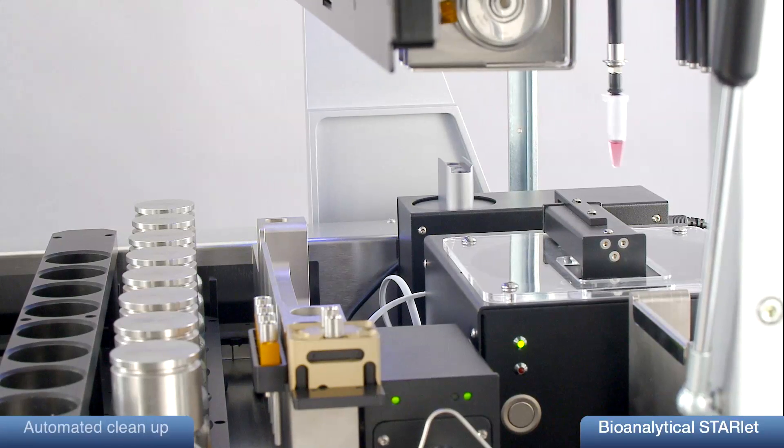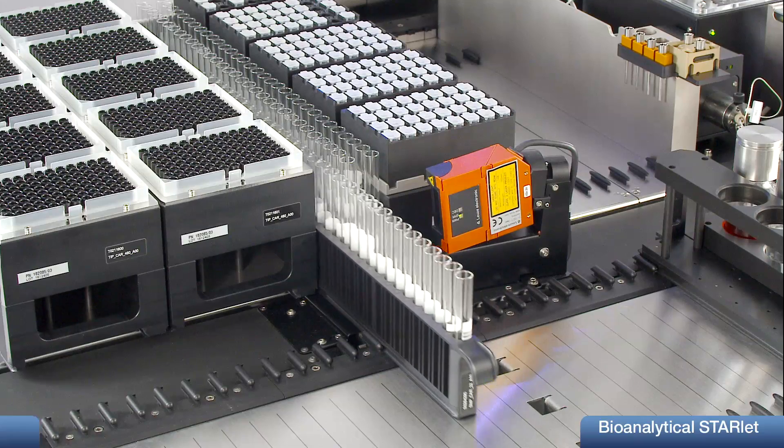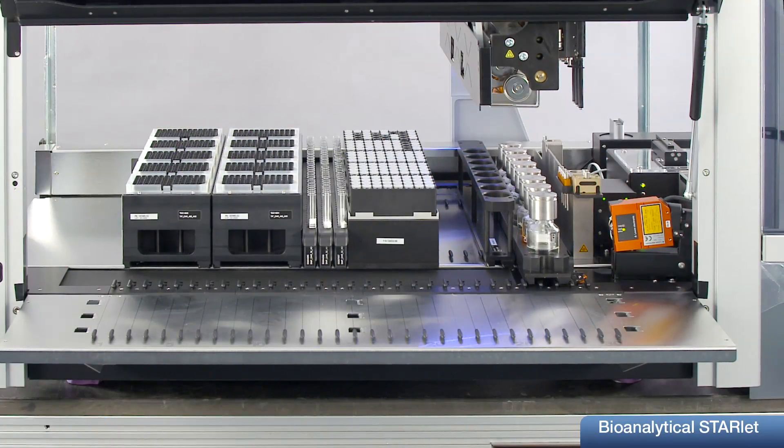To avoid errors, a cleanup procedure is done before each run. The autoload functionality with its load and match functionality secures the correct sample loading.